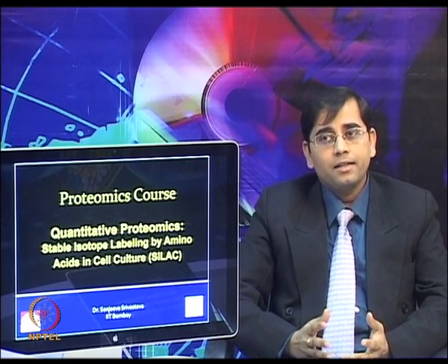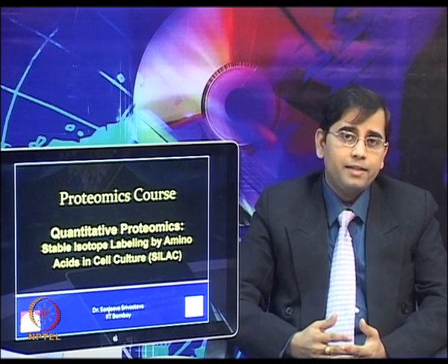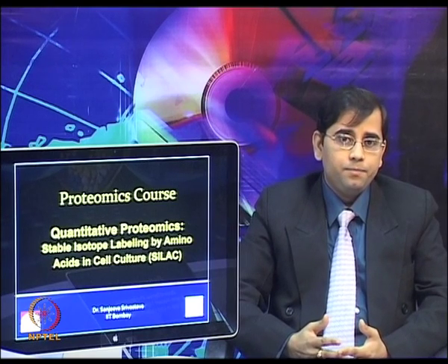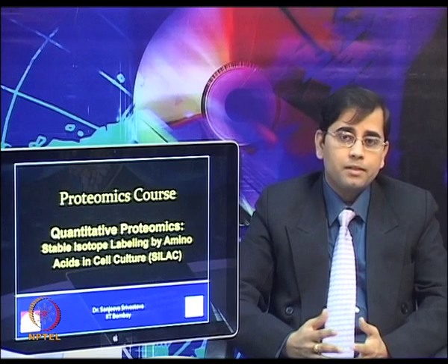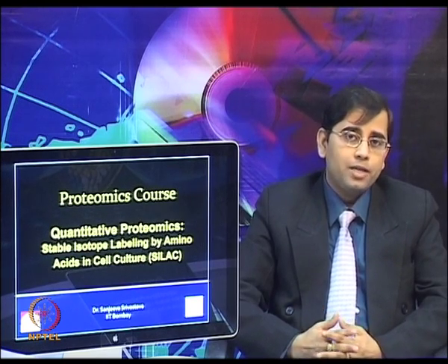Many advancements in MS during the last decade have provided new ways for protein analysis and facilitated the study of proteomic analysis of various biological systems.